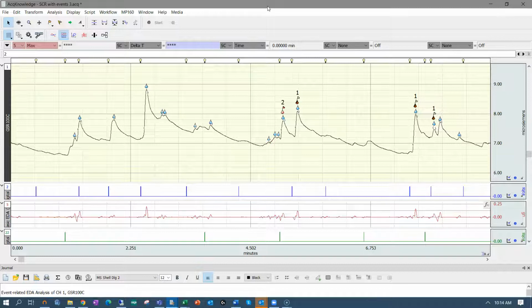perform multiple steps. So again, in this one, we opened the graphs, we filtered, we converted our digital triggers into STIM events, and then we ran the EDA event analysis using these STIM events that were in the software, and output everything into Excel so that we end up with a unique Excel file for each of the files that we've analyzed.